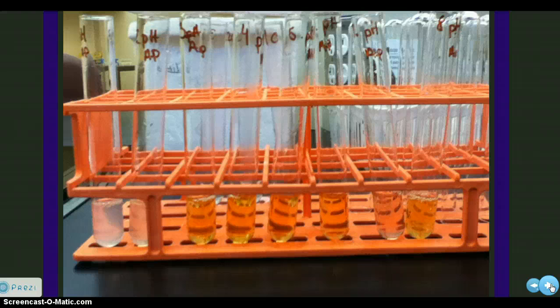We started seeing changes. What we saw was that pH 2 had no reaction, a 1. The second, pH 4, again had no reaction, only a very, very light change, so barely anything. We labeled it a 1. pH 6 showed a reaction. pH 6 through pH 10 all showed a very positive reaction, all labeled 3. All differed in their time getting there. However, in the end, we can tell that they're all about the same.